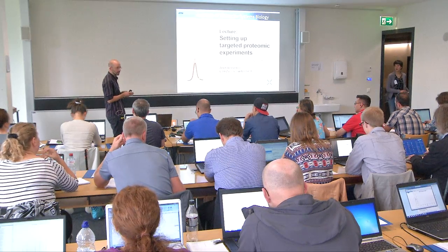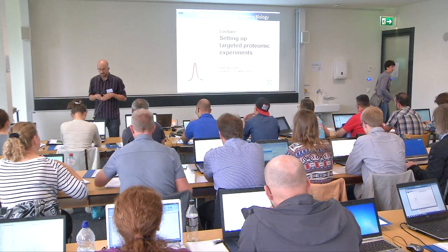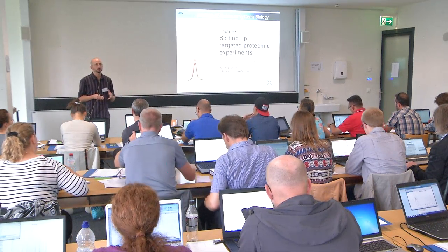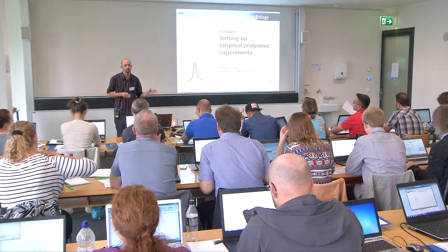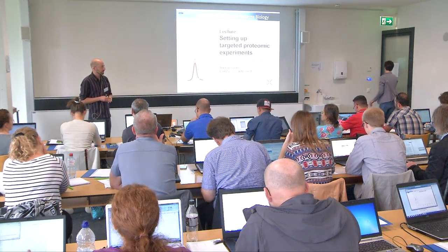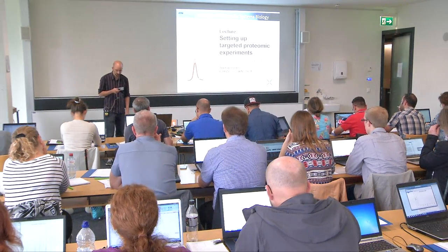We'll do a lecture about how to set up a targeted experiment. And after that point, we will continue with tutorial 3, so a little bit about how to work with assay libraries, and then we'll continue to tutorial 5. So as I said at the beginning of the day, we skipped tutorial 4. It's in your folders if you want to do it, and that will be about retention time and scheduling. So, setting up a targeted proteomics experiment.